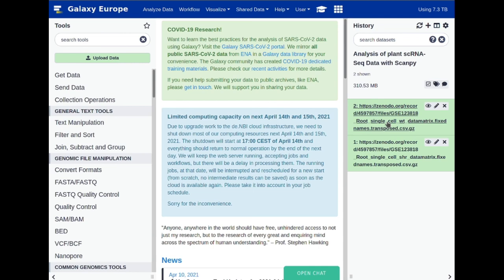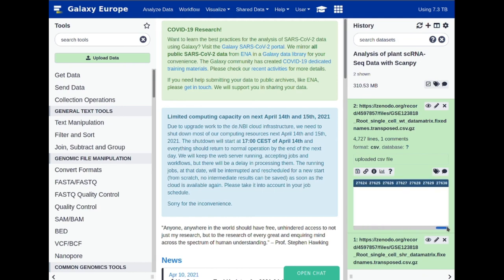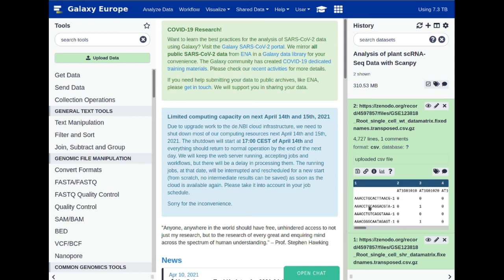These datasets are now green, indicating they have been imported correctly. Notice that the top one has 'WT' meaning wild type, and the bottom one has 'SHR' meaning short root. This may not be the same for you, so be careful when you apply these tags. To apply the tags, just click on the dataset to expand it. You can see there are 27,000 columns. It might take some time to expand because this is a quite large dataset. Click on the 'Edit Dataset Tags' button and type in '#WT' for this one, then press Enter.